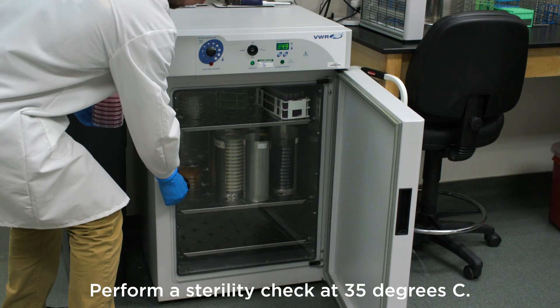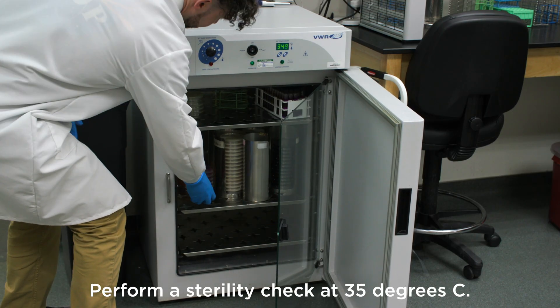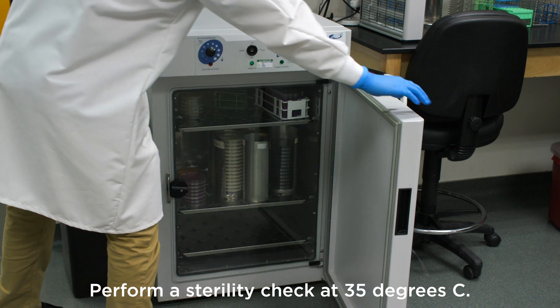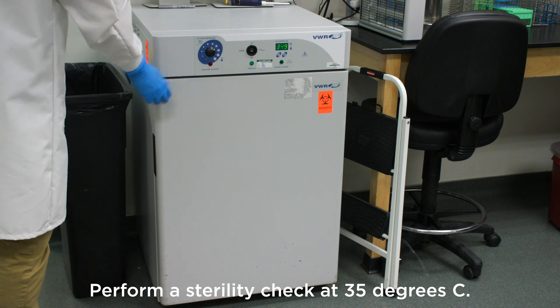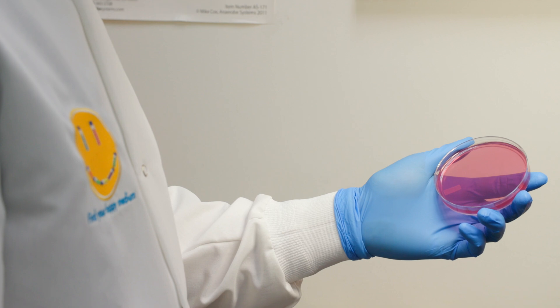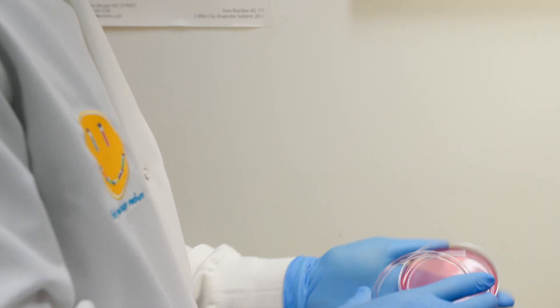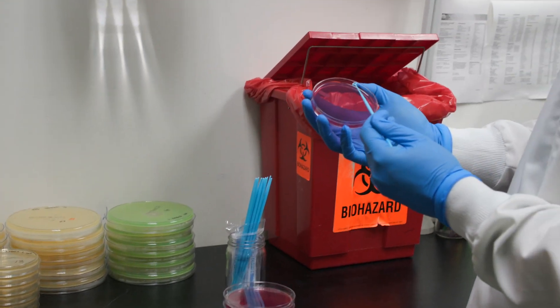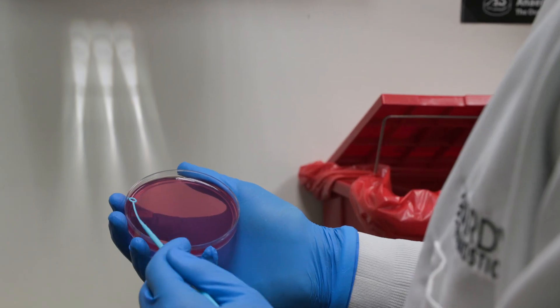As a sterility check, you can incubate several plates at 35 degrees Celsius to make sure there are no contaminants. Check them daily for at least three days. Most media plates have a shelf life of up to three months when stored properly, but it depends on the type of media. Validation studies must be performed.